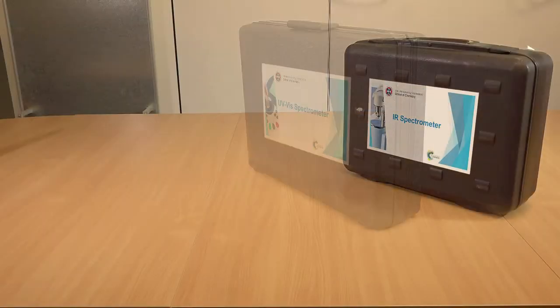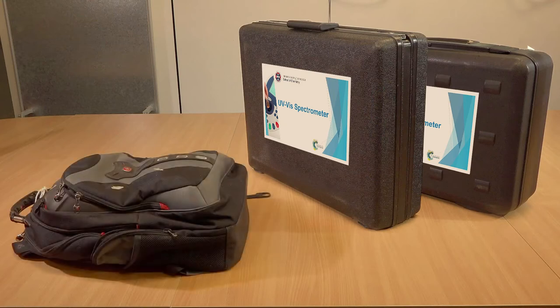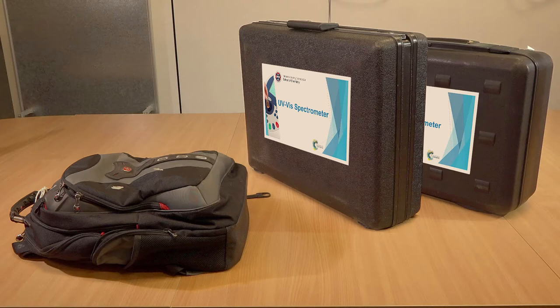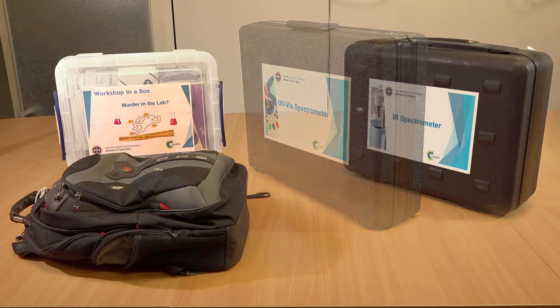Workshop in a box comprises two suitcases containing an infrared and a UV-VIS spectrometer, a rucksack containing the IR spectrometer power supply, a laptop and teaching materials, and a box containing samples for use in the workshop. If any of these items are missing or damaged, use the phone number provided with your booking to report the problem.